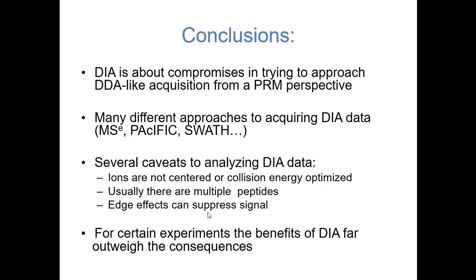What we find doing Pecan analysis, that's going in blind without any knowledge of the peptide fragmentation or retention time, is that if we include SSRCalc as one of the features, it doesn't perform any better. That's how we've come to the conclusion that SSRCalc is a good starting spot, but it's not something you would necessarily trust to give you a leg up with DIA.